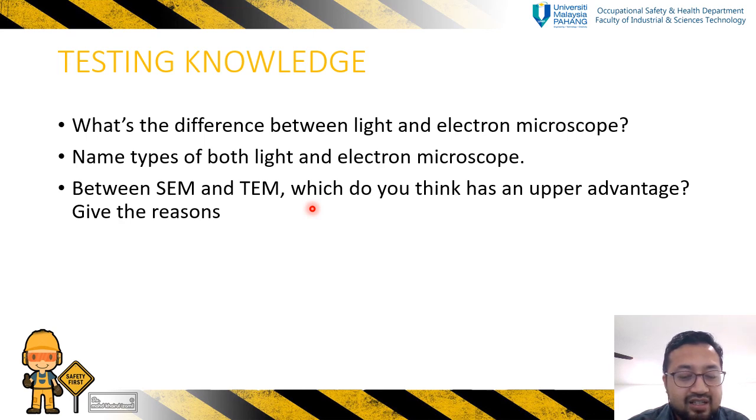Perbezaan. Mungkin ada lain yang nak share? Anyone? Siti Zulaika. Apa kelebihan SEM berbanding transmission? Okay. Apa kelebihan SEM berbanding TEM?